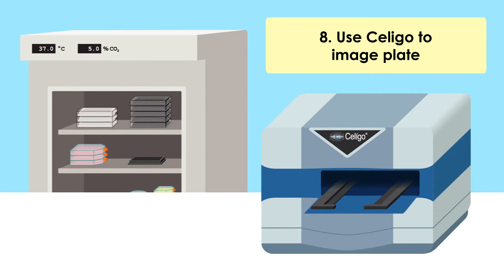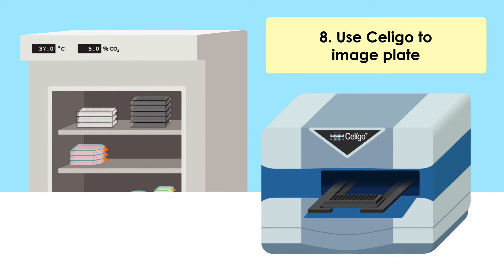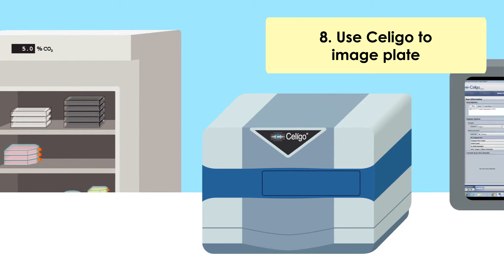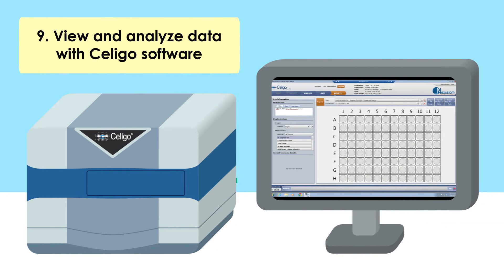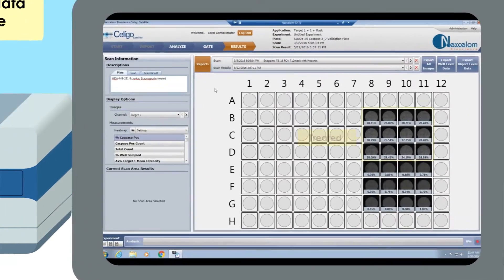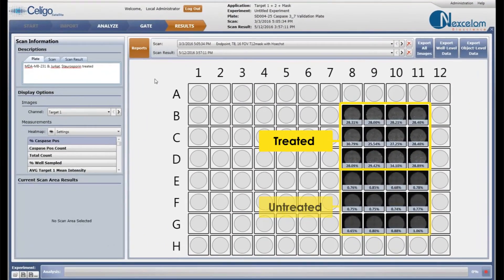Whole-well imaging of 24 wells was captured in three and a half minutes. The analyzed results are displayed in a plate-based format showing a thumbnail picture and percent of apoptotic cells for each analyzed well.